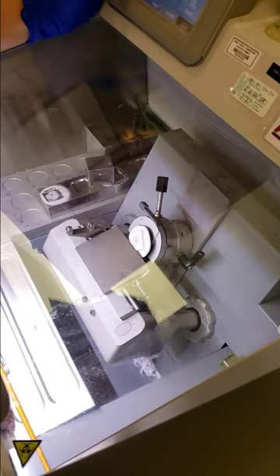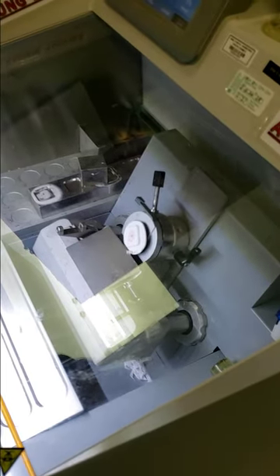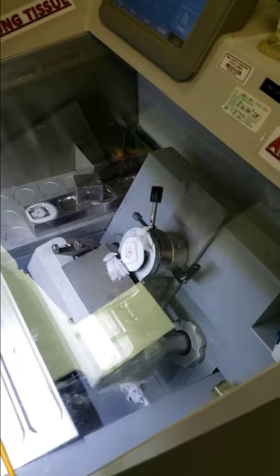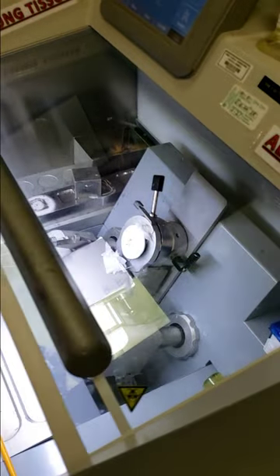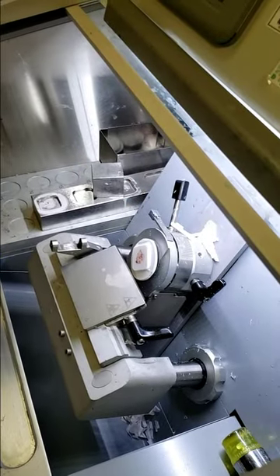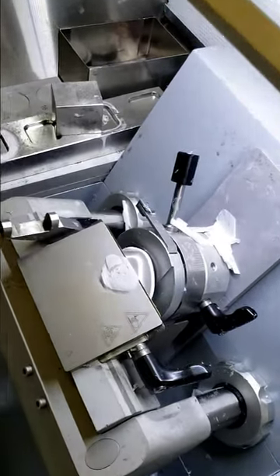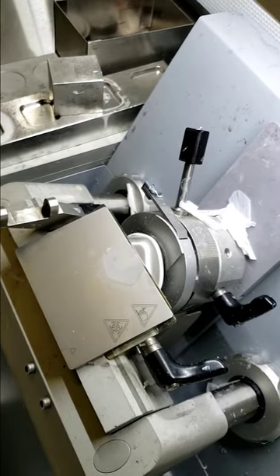Now the tissue block is going to be sectioned through. There's a sharp blade in this cryostat. You can just start to see that the white part is disappearing — these are like five micron thick sections, cutting into the tissue so we can get a piece to go on to a slide. Now we've cut deeper, and I'm going to take a nice thin section of the tissue, surrounded by the OCT, which helps us pick it up.